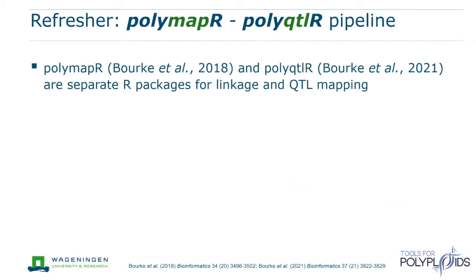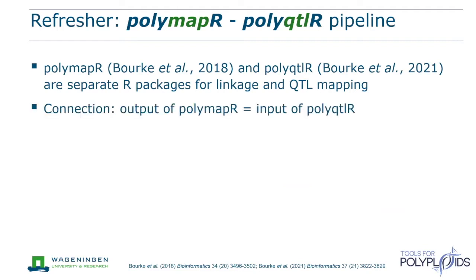Okay, so to start off with a bit of a refresher, first of all, of this pipeline, these two tools, polymapR and polyqtlR, they're separate R packages, but they do talk to each other in the sense that the output of polymapR is directly the input of polyqtlR.